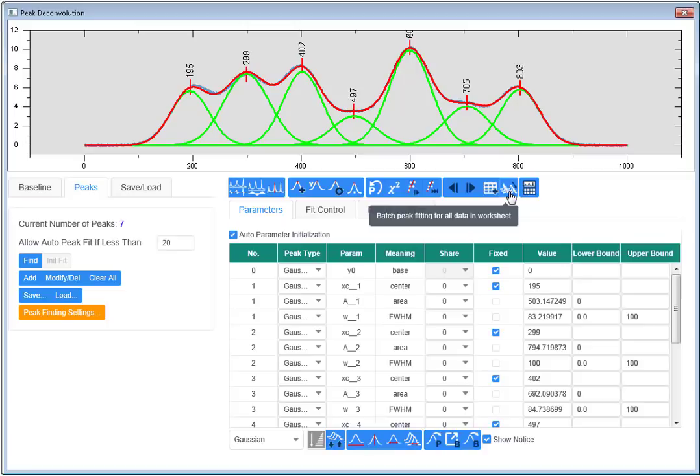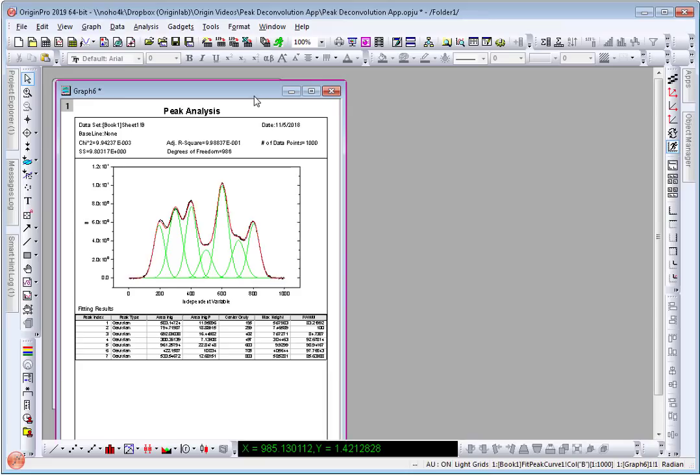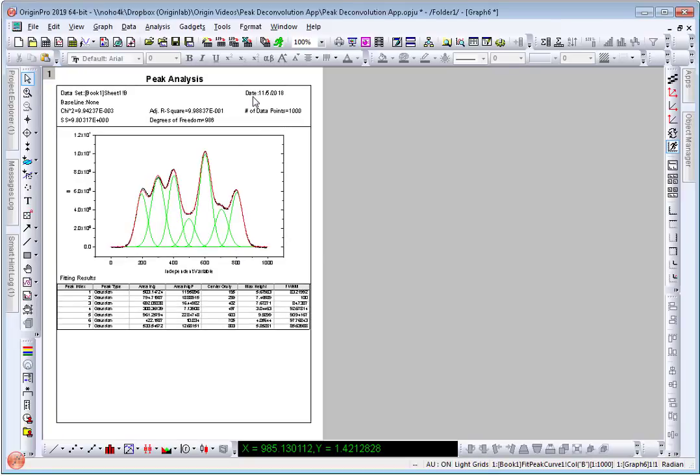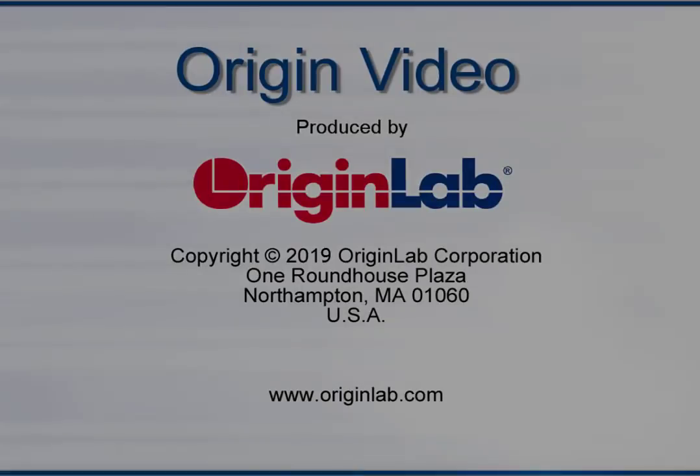And lastly I can create a report for the current data. I will select this option which will close the app and generate a nice report graph and a table with values and cumulative fit peak for the individual peak lines. Hope this app is useful and please provide feedback.